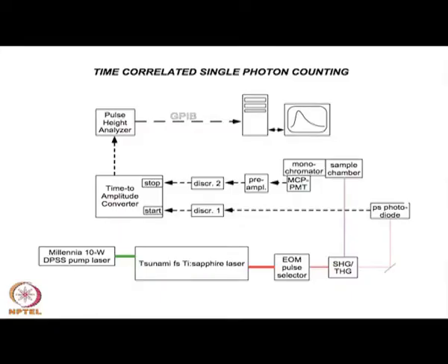But in some cases, if more than one species is involved in the decay process, like one is your locally excited emission and another is some converted species, suppose this locally excited state undergoes some specific alteration so that it gives emission at a different frequency, or maybe in a similar frequency range with a different time constant, then your data will not be a single exponential one.